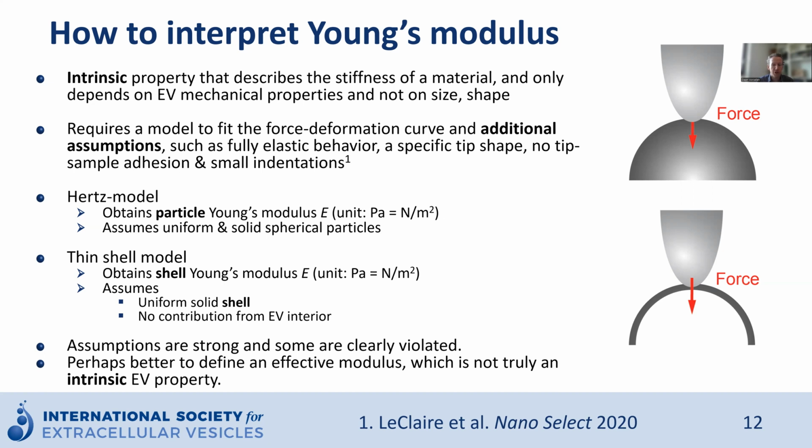They typically use the Hertz model that I discussed above, and while convenient, be aware that this is still prone to the same pitfalls and the same assumptions. Using these imaging modes to derive mechanical parameters also gives you less control over the fitting interval and less insight into the goodness of fit than if you separately make force indentation curves.